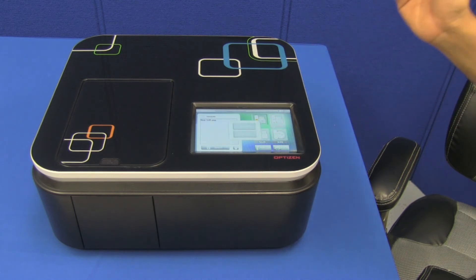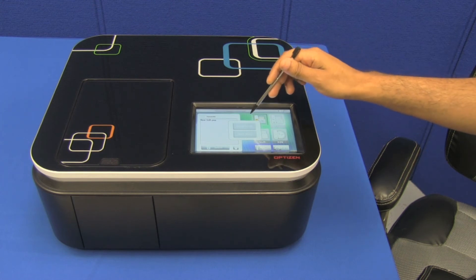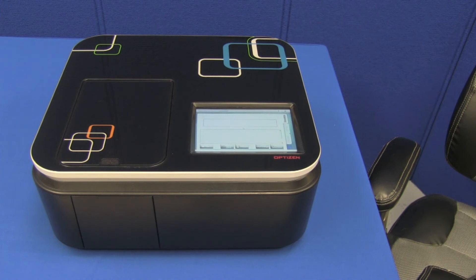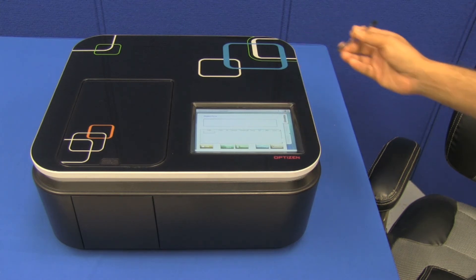At every stage you'll be given voice instruction on what you're actually doing. I'm going to select single wavelength mode here. The system responds: 'ATC mode — ATC mode leads to measure absorption, transmittance, and concentration. Before measuring, input wavelength and select cell holder and setup menu.' Come on, what more can you ask for? It's telling you exactly what you need to do and what you need to know.